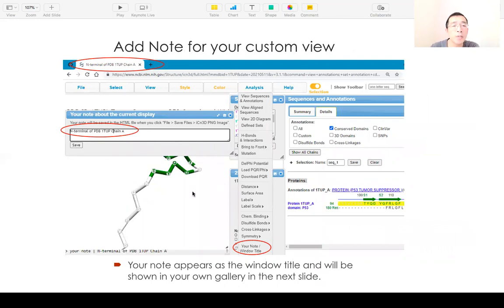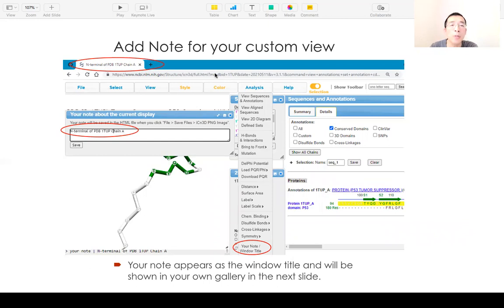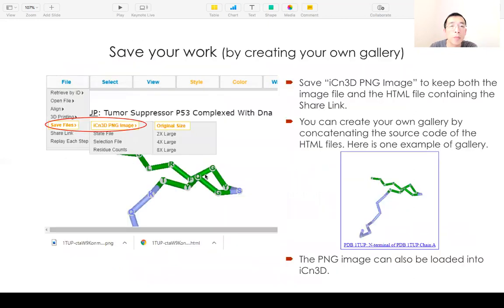Once you have a custom display, you can add a title and a note for your custom view. The note will also show up as the window title, so if you have multiple tabs open, you can easily tell from the window title which one is which. If you want to save your custom view, you can go to 'Save File' and choose 'iCn3D PNG Image'.